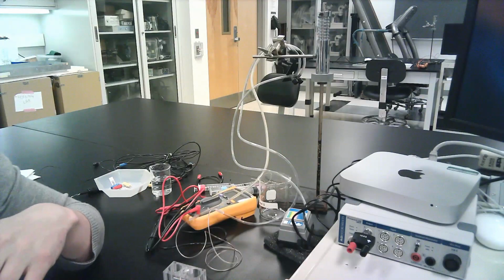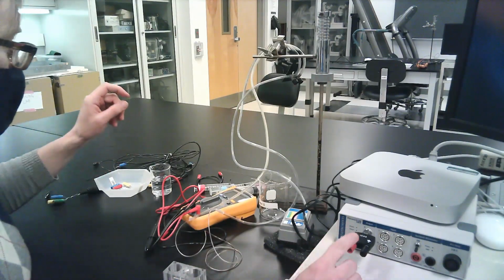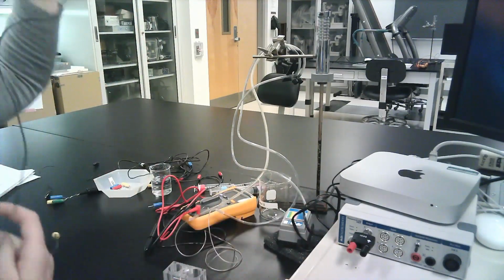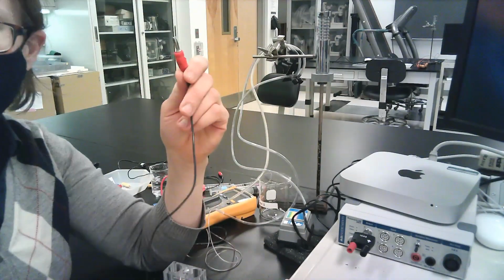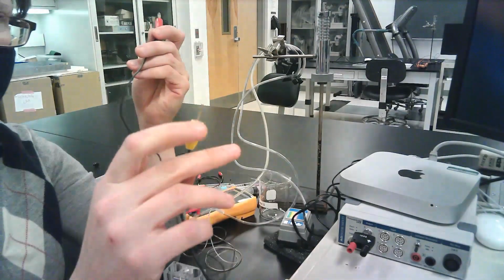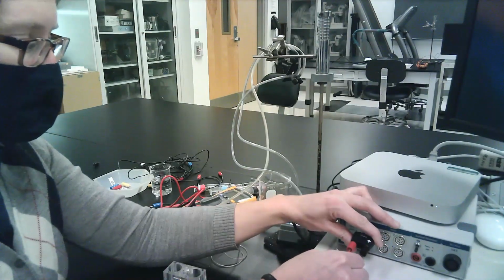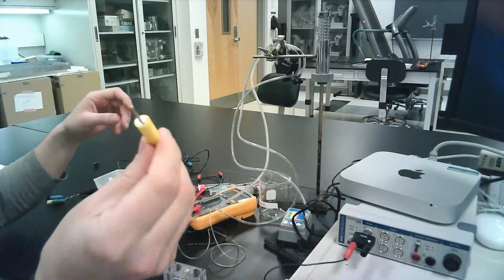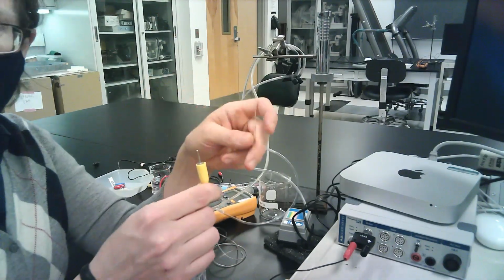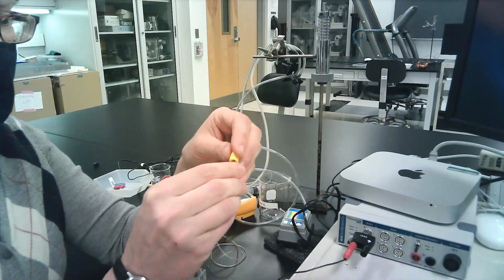From there, then, the next thing we're going to do is we'll start on the stimulating side, so I'm going to start on the red side here. If you look amongst your wires, you'll find a wire that has a banana plug at one end, and then it has a yellow connector at the other end. So you're just going to plug the banana plug in, and then for the yellow end, that's going to connect up to one of our stimulating electrodes here in yellow. So this just plugs together.